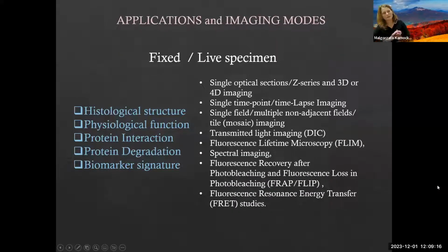So what I want to talk about today are some applications. And I know that you probably joined previous seminars provided by Dr. Dan or Connor, so you may know our systems a little bit, but I feel like there wasn't enough information or examples about different types of applications.